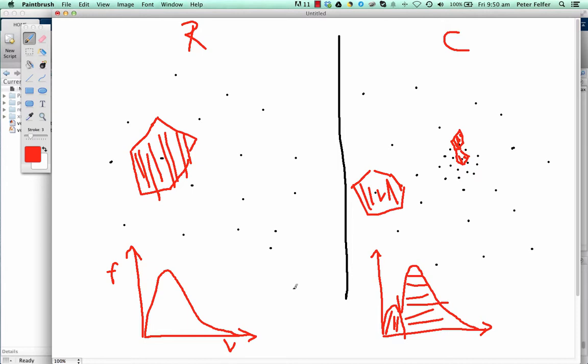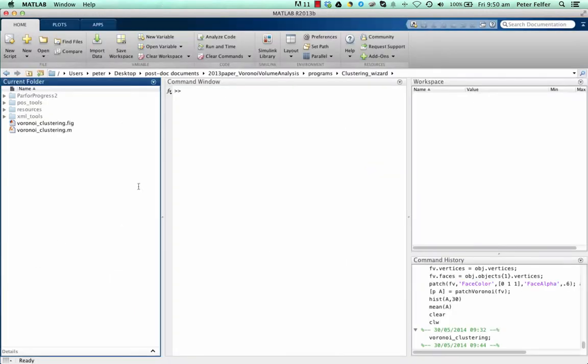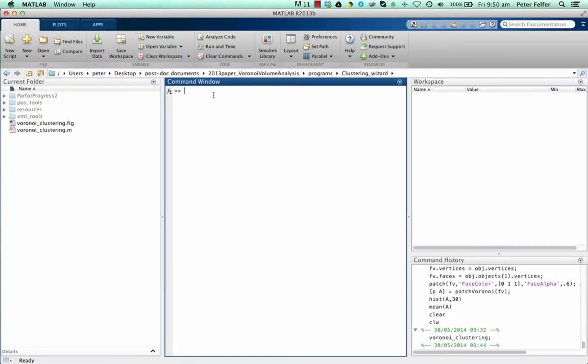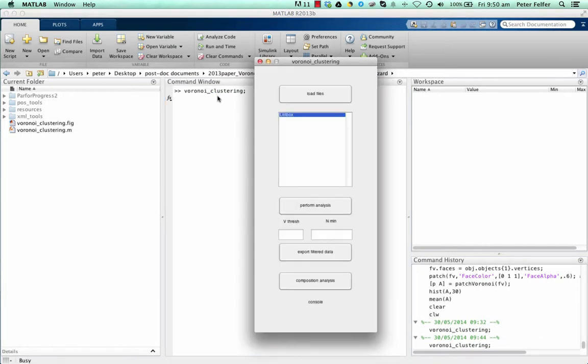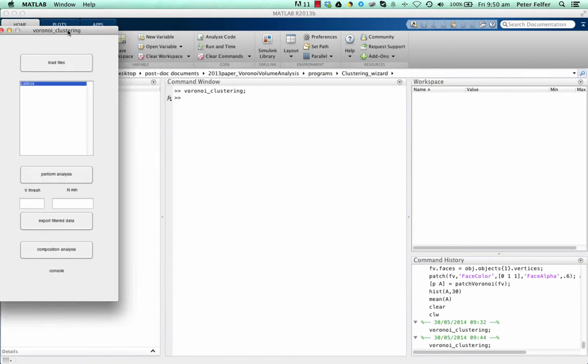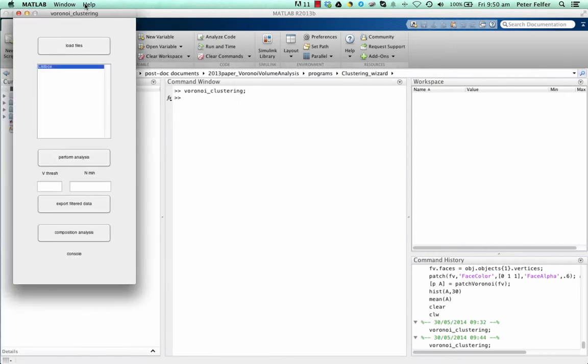I'll show you how to use the programs now. For our example, everything is running in MATLAB, so the programs that are contained with the paper are running in MATLAB. All you need to do is type in Voronoi clustering, and that starts the wizard. As you can see, the wizard is very simple as well. You need to actually follow the steps.